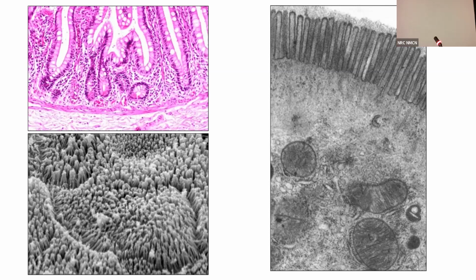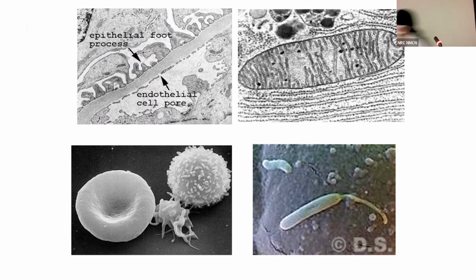In scanning, yes, you have an actual picture where you can look at the 3D surface. Absolutely. I'll come to that, but most of the IITs in India, because they deal with a lot of material science, have these high-end microscopes which look at these structures, and they are 3D constructions. Okay, now again, which one is scanning and which one is transmission? Just to tell you the concept.